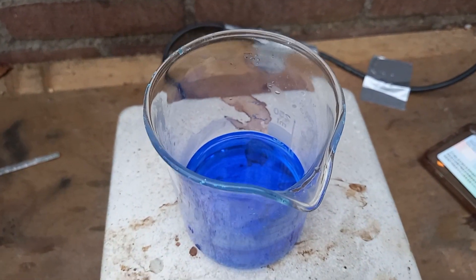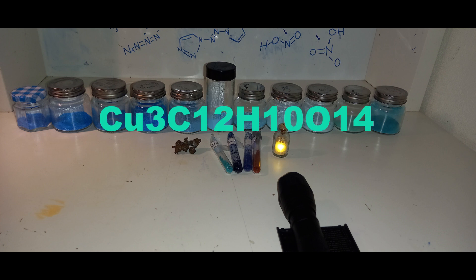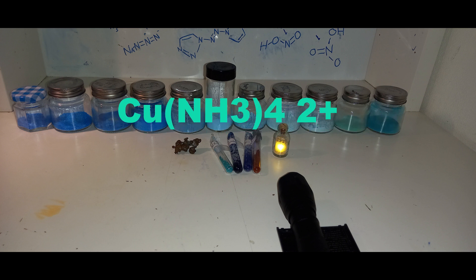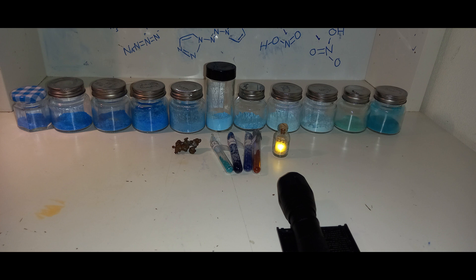So the copper salts I already made are potassium dioxalate cuprate, copper nicotinate, copper acetate, copper sulfate, copper citrate, copper chloride, copper oxalate, and copper ammonium oxalate dihydrate, some copper tetraamine complexes, and the yellow fluorescent complex with pyridine and copper iodide. I have no idea what it's called, but those are the ones I've made.